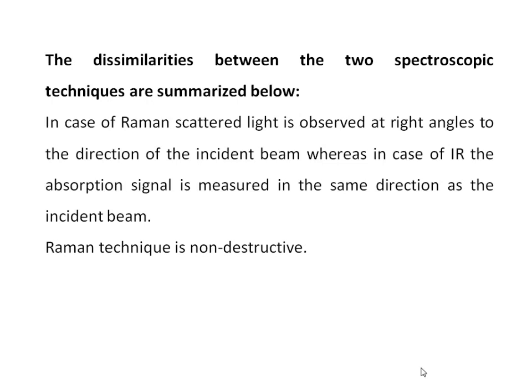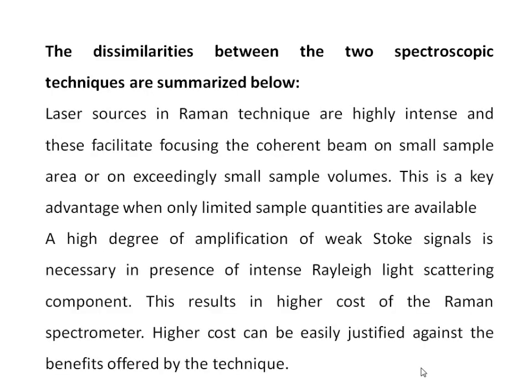Raman technique is a non-destructive technique. The laser sources used in the Raman technique are highly intense and these facilitate focusing the coherent beam on a small sample area or on an exceedingly small sample volume. This is a key advantage when only limited sample quantities are available.